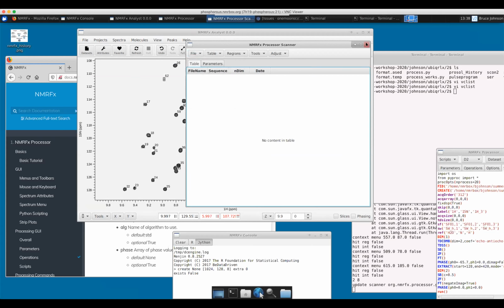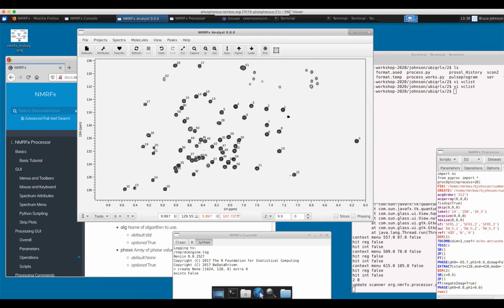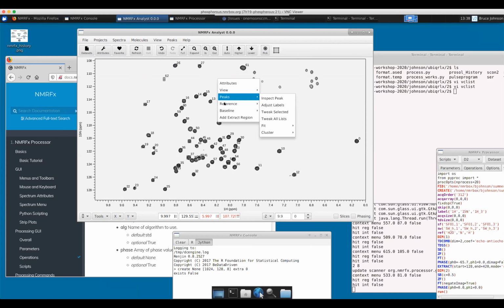Yes, Rajan. Bruce, so the fitting you showed with the right click, is that the only way you do that fitting, and where does it store the fit result? For example, if it uses the VC list number, I can convert that into time. In principle, I can do that, right? From the exponent, I can multiply it by my loop counter unit time. Yeah, if it is a simple multiplication. Sometimes, I know some Bruker sequences, it's actually a fixed offset plus a multiple, so it gets a little complicated.